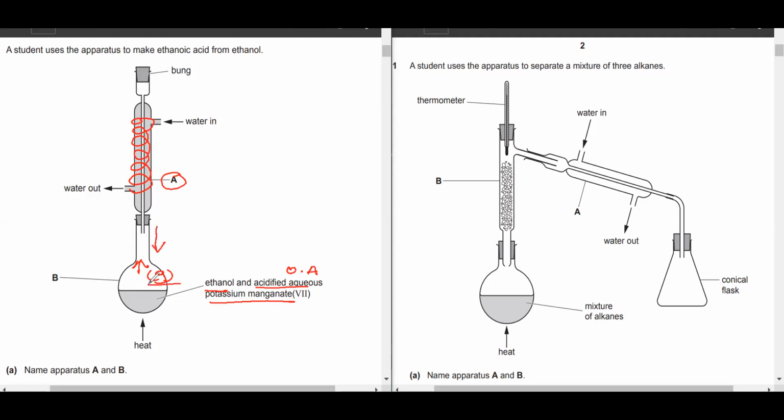तो आपका जो इंटरमीडिएट गैसियस स्टेट में था, जो वेपर्स के फॉर्म में ऊपर गया, कंडेंसर ने इसको वापस कंडेंस करके सेम रिएक्शन फ्लास्क में ड्रॉप डाउन करा ताकि उन वेपर्स का, उस गैसियस इंटरमीडिएट कंपाउंड का, सेकेंड स्टेप में ऑक्सीडेशन हो और उसके बाद वो कन्वर्ट हो जाए इनटू योर कार्बोक्सिलिक एसिड.